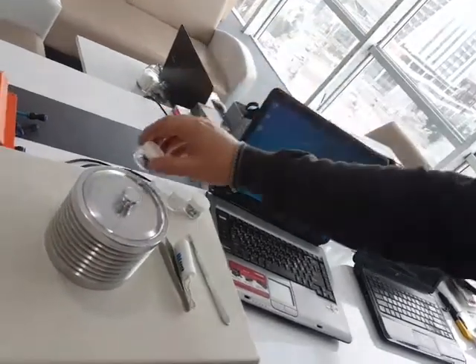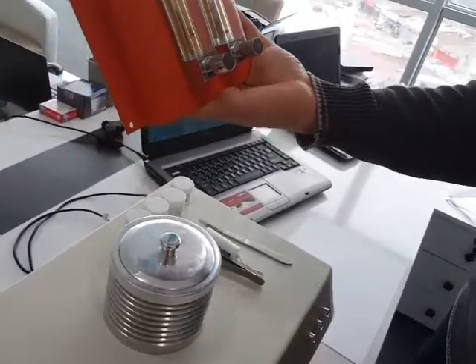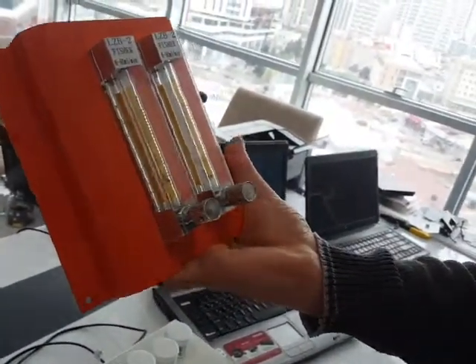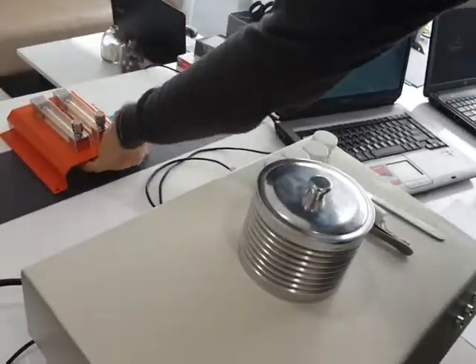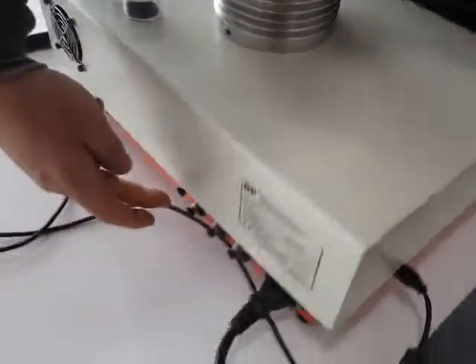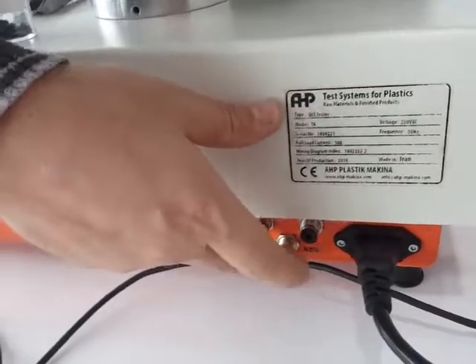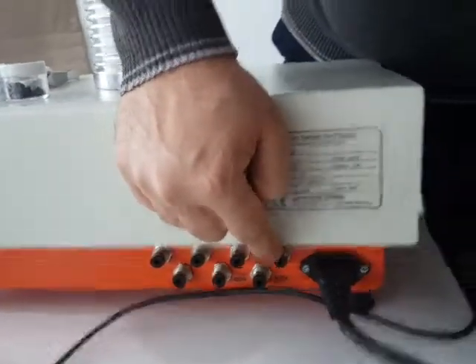It also comes to the customer with two flow meters: one for nitrogen and another for oxygen. On the backside of the machine, it has some quick-coupling air connectors and some labels that operators can see.